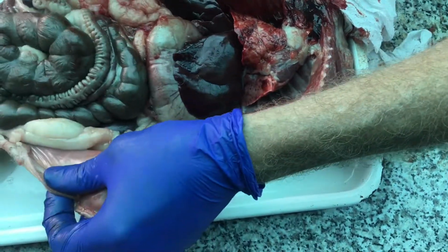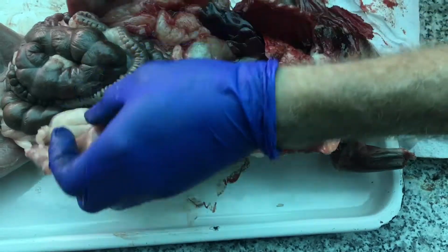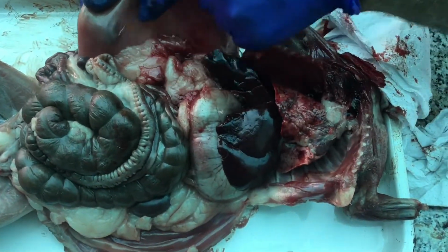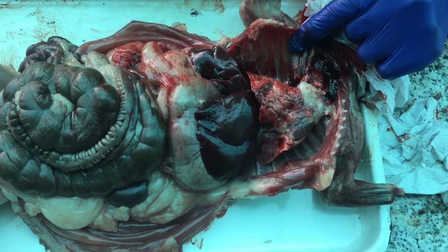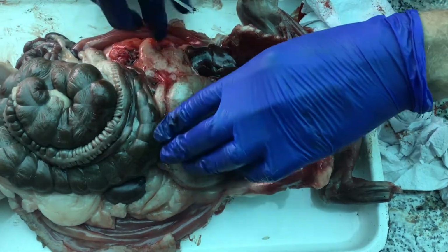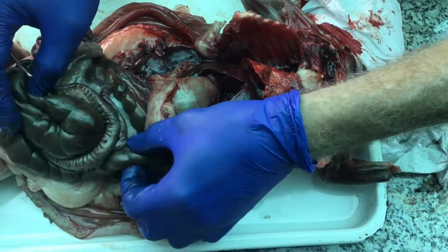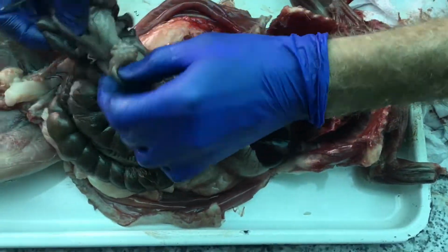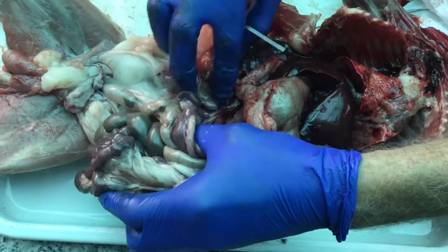When it's on the outer part of the body, it's the parietal lining: parietal peritoneum down in the abdomen or peritoneal cavity on the inner surface of the muscle, parietal pleura up in the chest cavity on the inner surface of the ribs. It then connects at the back. Remember, I've got the mesenteries going out to every single loop of intestines. When I hold up any one of these loops of intestines, I can see that nice, thin, sheeny mesentery. It all connects back to the back body wall.